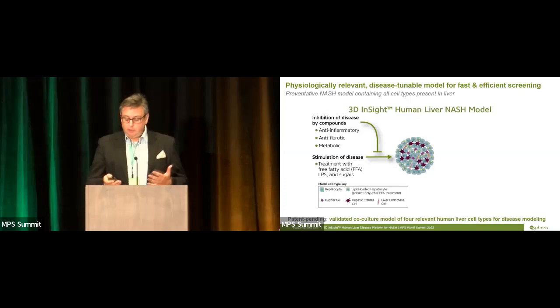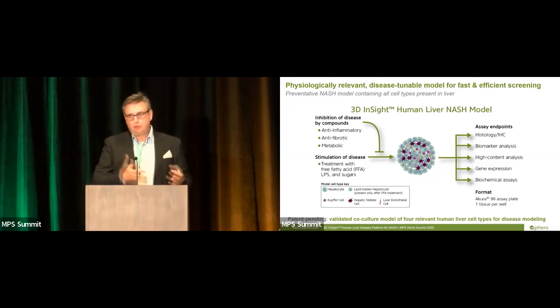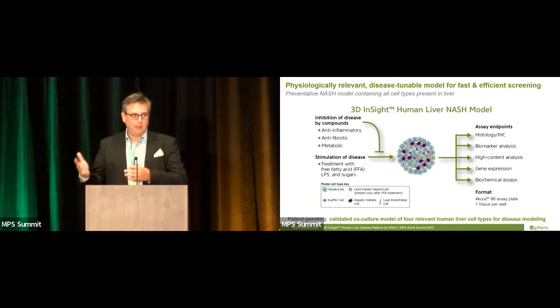What's important is that we have a pretty substantial battery of assay endpoints that, on the one hand, are screening compatible because we want to upscale that system for automated screening. On the other hand, we also have endpoints that have high clinical relevance because ultimately we want to convince pathologists and researchers that this is a functional model and that they can relate this also to clinical endpoints.